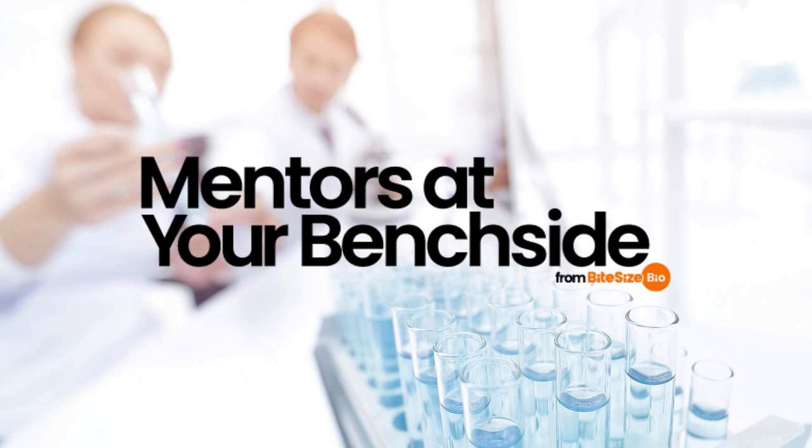The same applies to calculating the nuclei extraction efficiency. If there are 100 events on screen, but only 50 are nuclei, you have 50 cells that will not get sequenced. An extraction efficiency of 50% probably means you must extend the lysis period or refresh your lysis buffers and try again. While you should aim for as high an extraction efficiency as possible, no target value applies to all applications. Providers of downstream applications may provide guidance for these quality metrics.